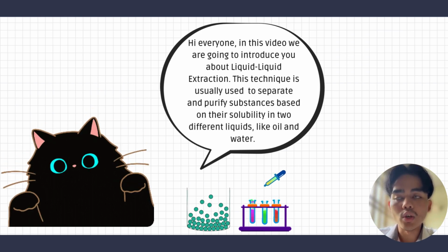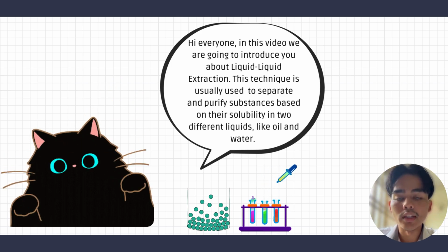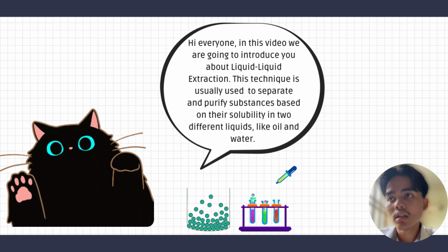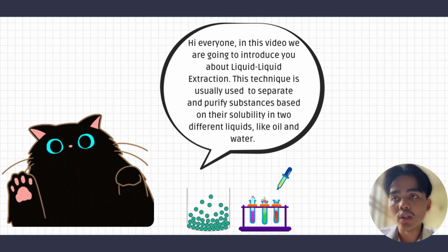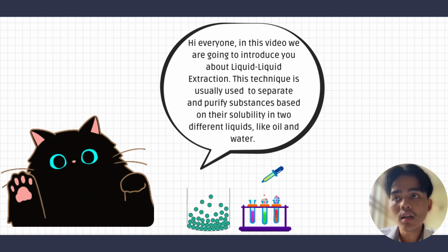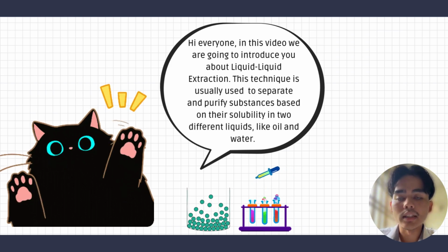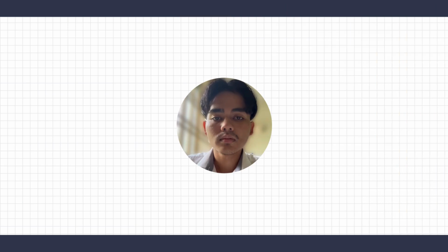So in this video, we are going to introduce you to liquid extraction, LLE. So what is LLE? This technique is usually used to separate and purify substances based on their solubility in two different liquids like oil and water.